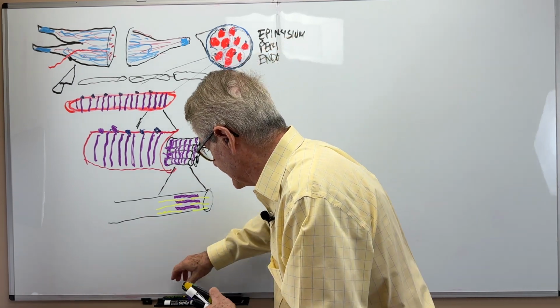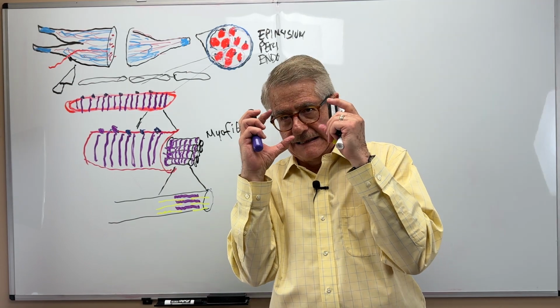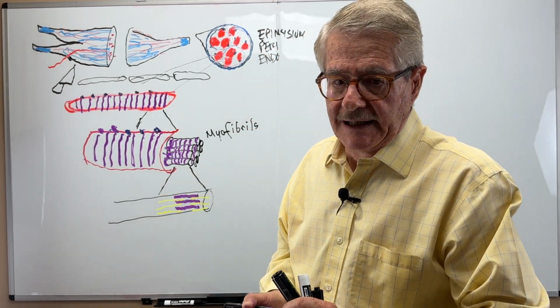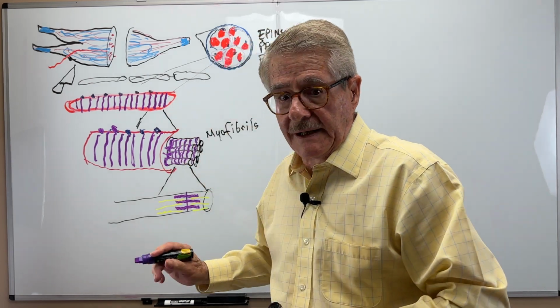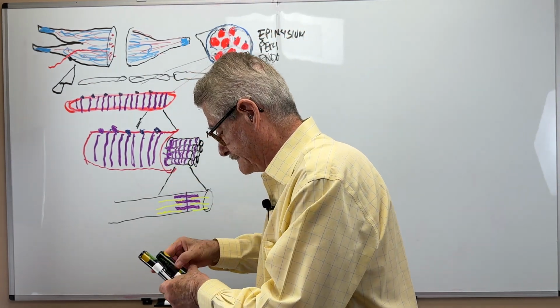It goes like this, and so now these fibers that are numerous in each myofibril are joined together here, right? And also here.